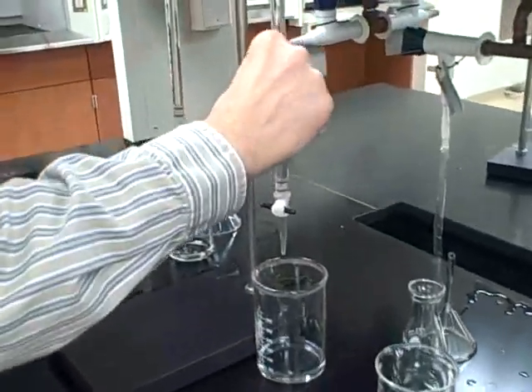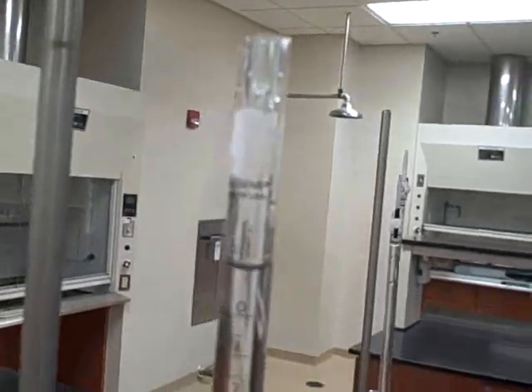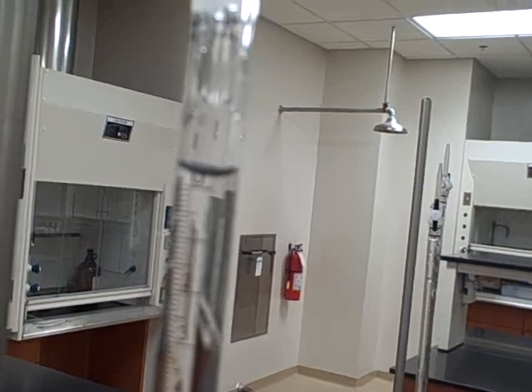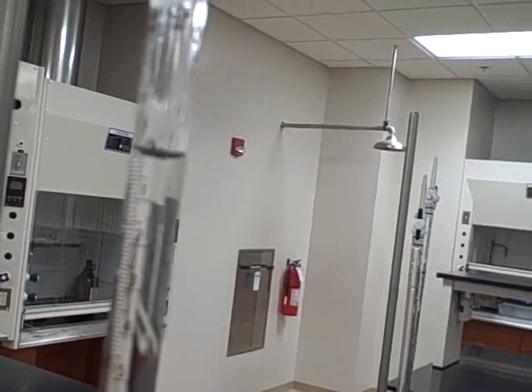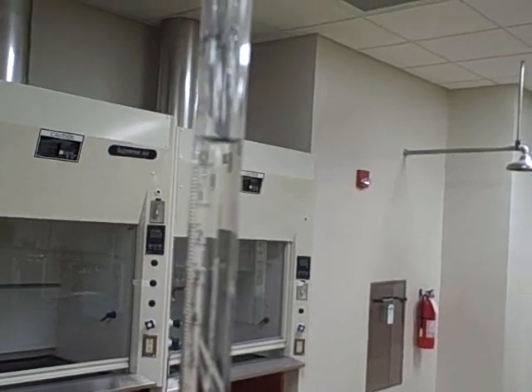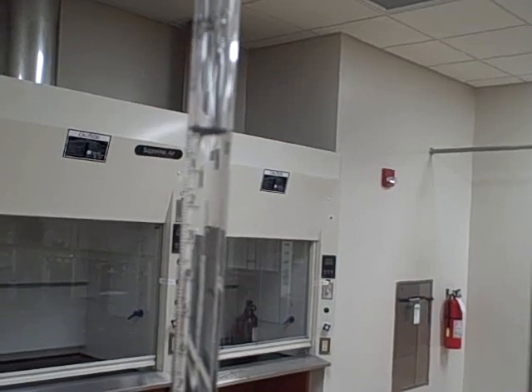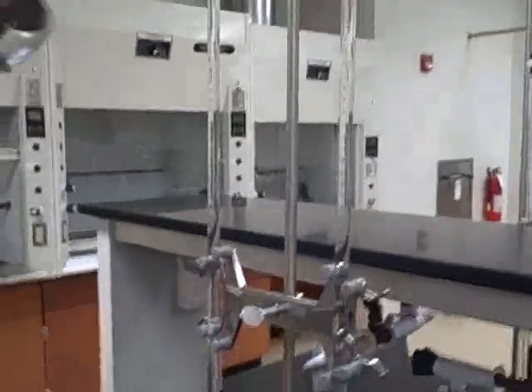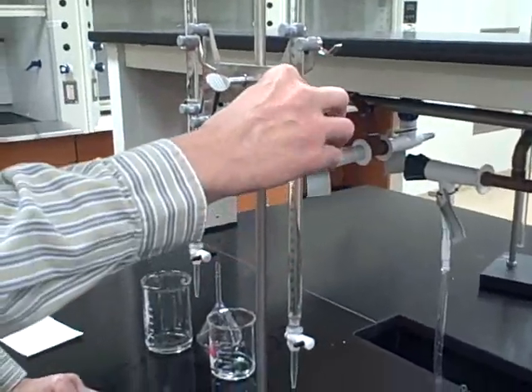What I'm going to do now, before I actually start the titration, is go ahead and set the volume here to zero. It doesn't have to be exactly zero — zero just makes it easier for the calculations later on the first run. I don't tell the students any of this; they're supposed to know how to do that. So now we've got an acid in this burette with an unknown concentration and a base with a known concentration.